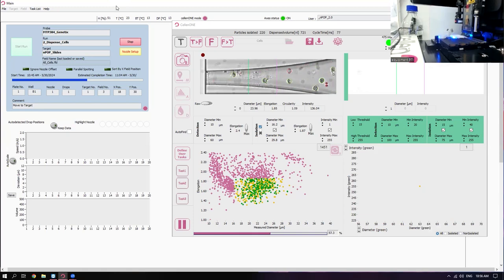Under the current circumstances, it may lead to some false negatives, where it thinks there's a particle in the background where there isn't. We should definitely try to clean up this nozzle. And I think that we have a new camera that we need to upgrade to that doesn't have the spots.